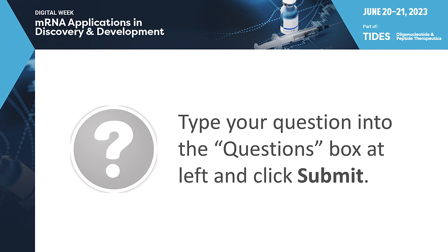Can fed batch IVT be continued indefinitely to reach higher RNA yield? That's a very good question. I think the answer is no, but I would love to be proven wrong. The reason is that feeding, of course, also dilutes the reaction. So unless we combine it with some kind of volume reduction step, I think in the sense presented today, it cannot be continued indefinitely. But this is a fast evolving world, so here's a challenge to my colleagues.